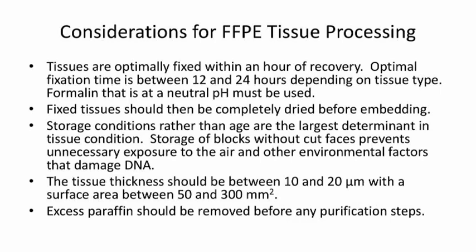Tissue thicknesses between 10 and 20 micron with a surface area between 50 and 300 millimeters square, ballpark. And that's just to get enough material to isolate. And then excess paraffin, of course, has to be removed before any purification steps. A couple different ways to do that.